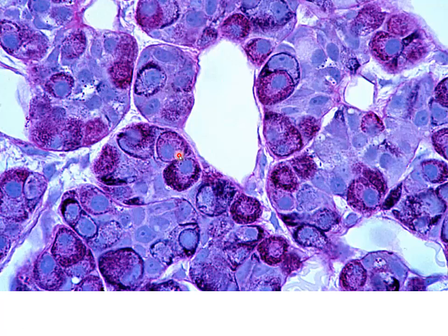We're not going to be able to identify the cells that aren't staining. Those would be the acidophils and the chromophobes. But with this particular stain, we can see the abundance of the basophils in this particular tissue, part of the adenohypophysis.